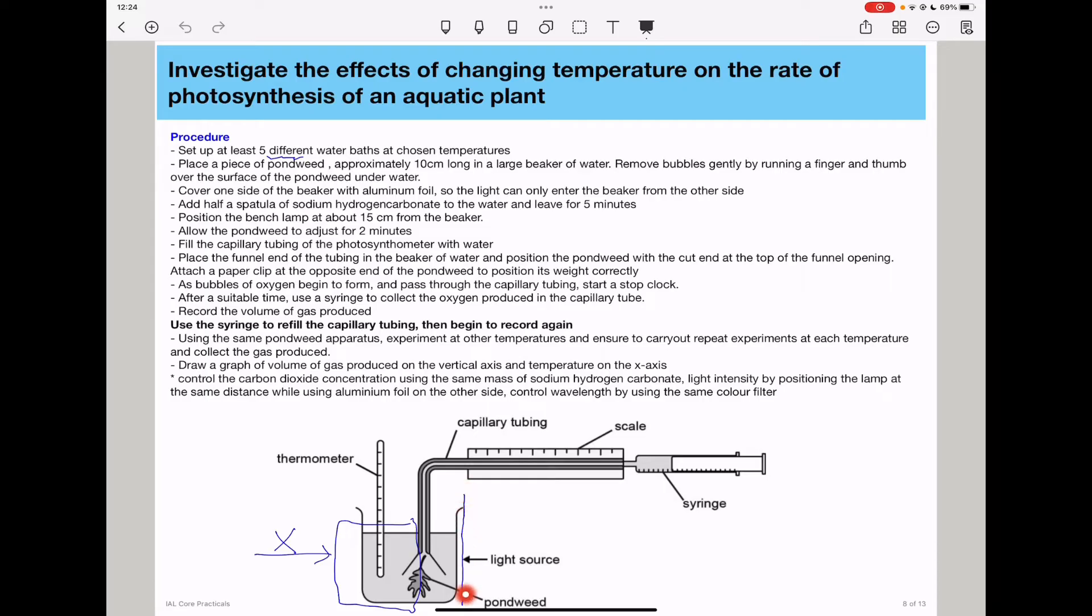At this point, you could choose to position a color light filter so that the plant is exposed to the same wavelength. As bubbles of oxygen begin to form and pass through the capillary tubing, you need to start the stop clock. Remember, every experiment should be carried out within the same time frame.